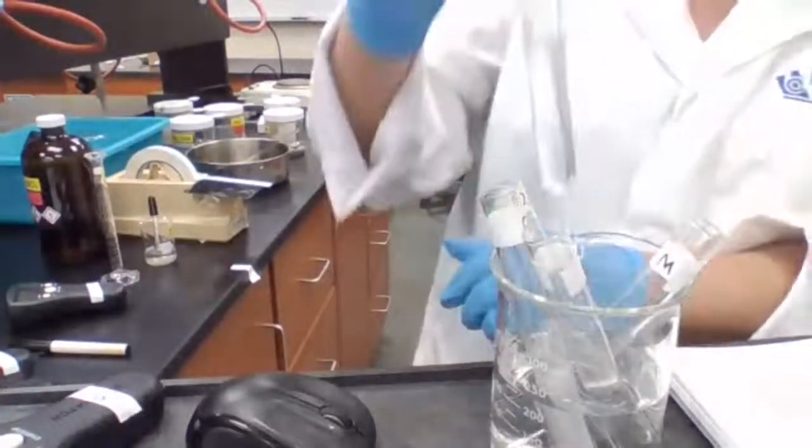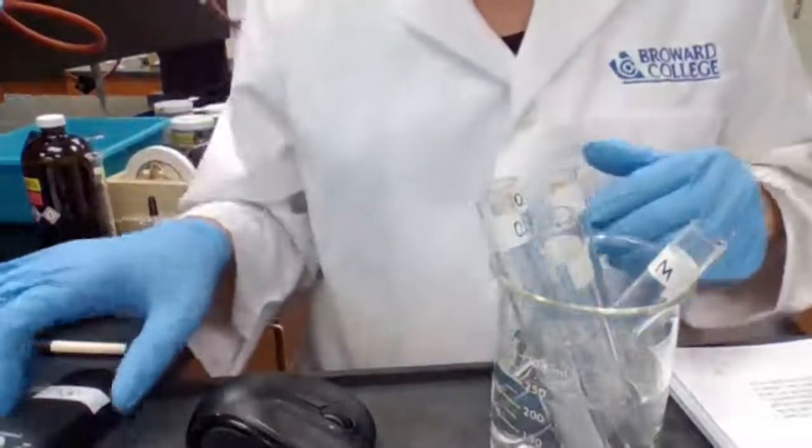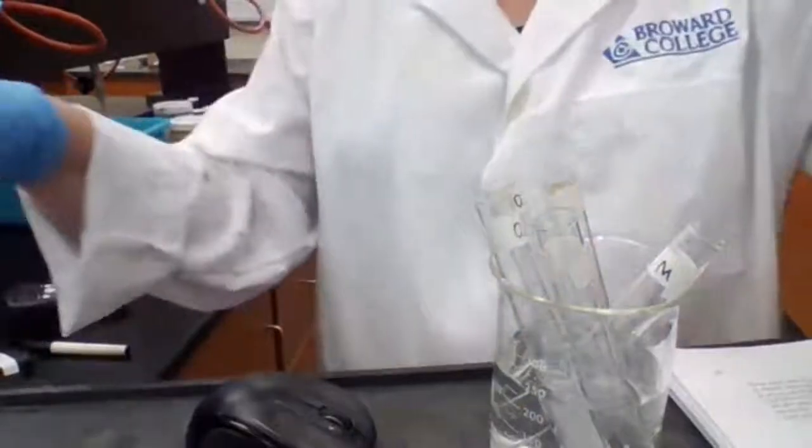Okay, the first one dissolved completely at 256 seconds. So for the first one, it took 256.